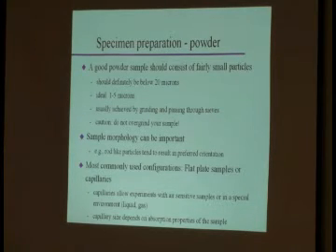Now, some people actually get overzealous and they do a really good job grinding. So, one word of warning, do not overgrind your sample. Okay? Because what happens then is, you could be going below your ideal size, or you could be introducing a lot of defects in your powder if you're too harsh to it, okay? What that does is, it leads to all kinds of ugly peak broadening that makes your data treatment much more difficult. So, you don't want huge particles, but you do not want to overgrind your sample either. And that's where those sieves really come in handy, okay? They allow you to judge how far you've ground.